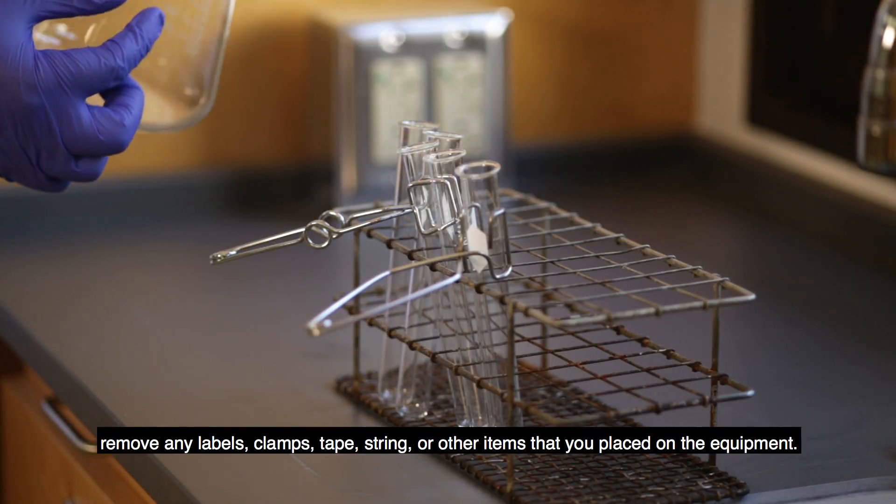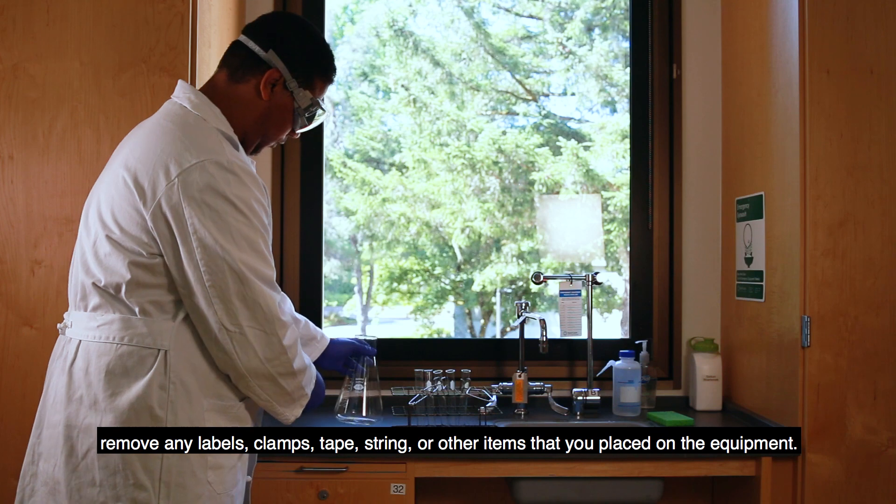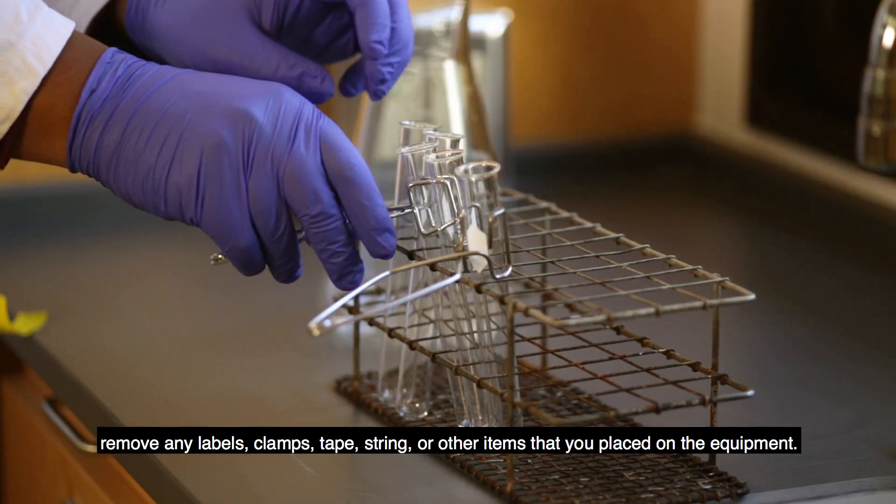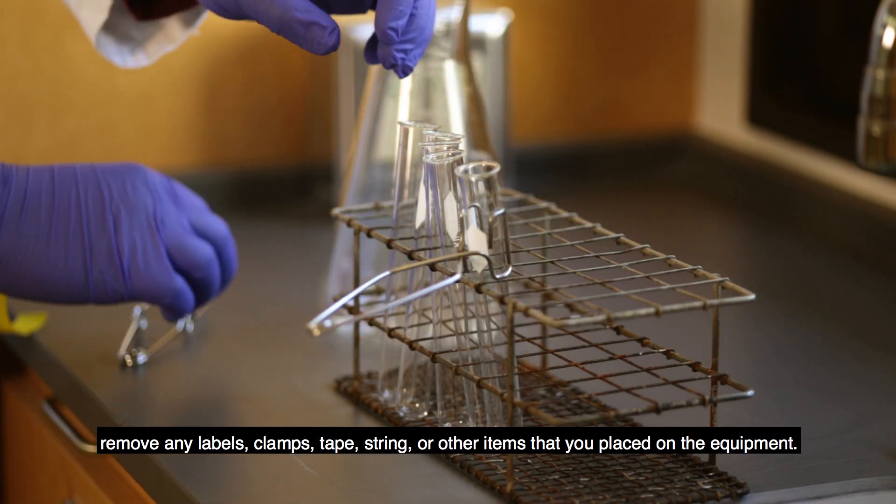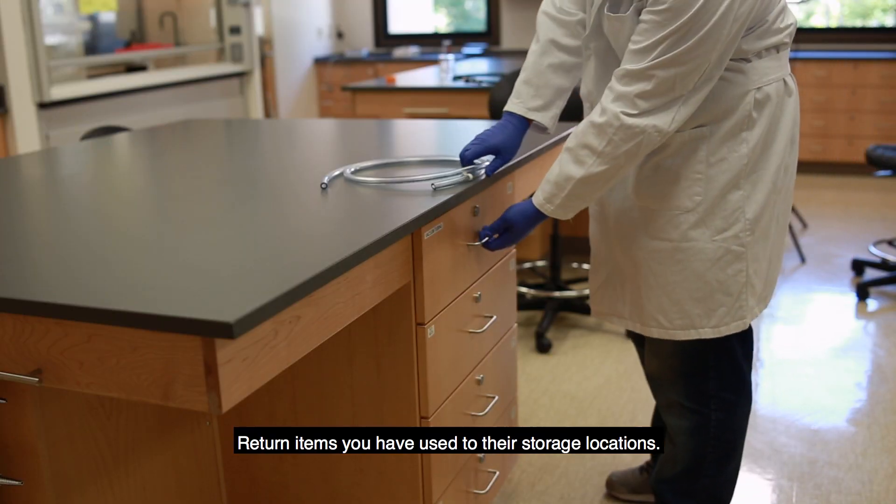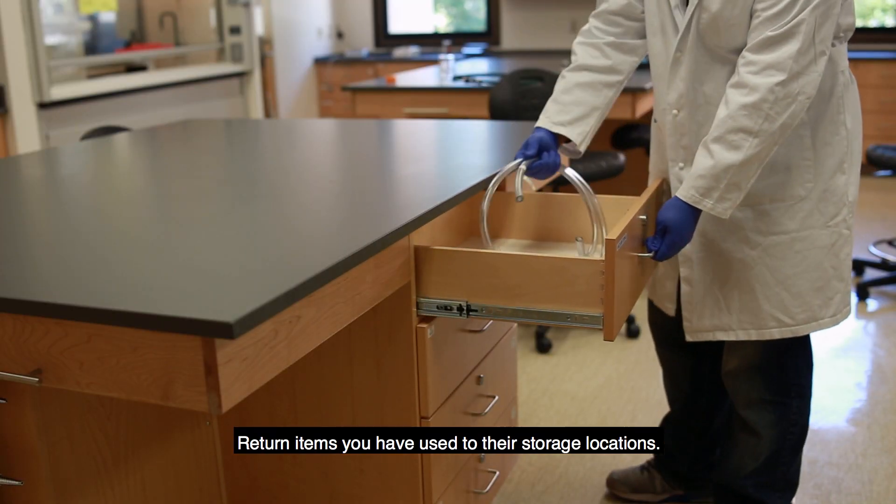Disassemble your experiment setup and leave your laboratory station as you found it. For instance, remove any labels, clamps, tape, string, or other items you have placed on the equipment. Return items that you have used to their storage locations.